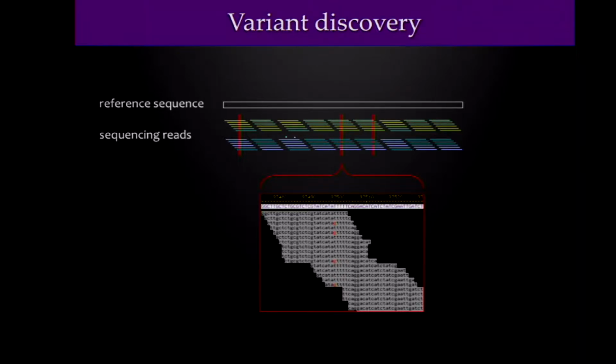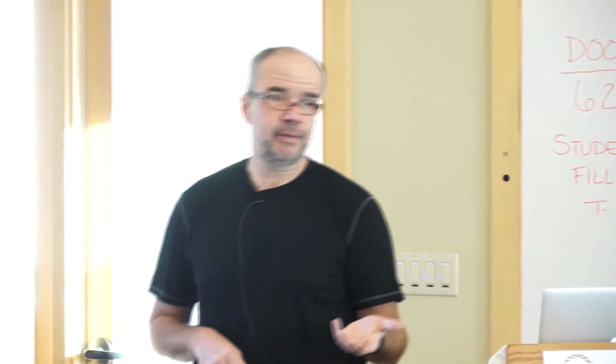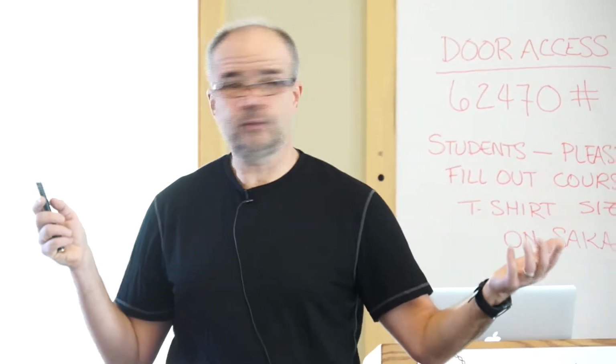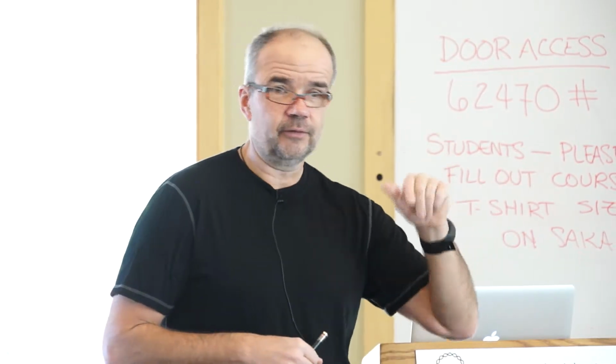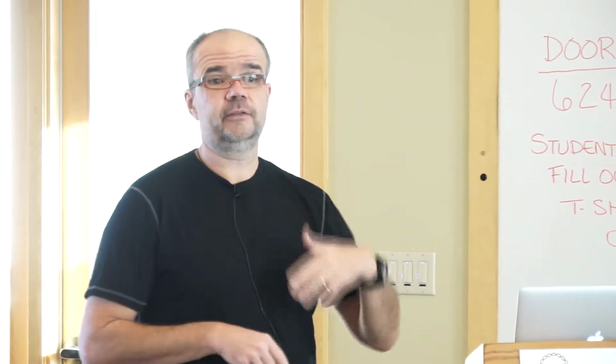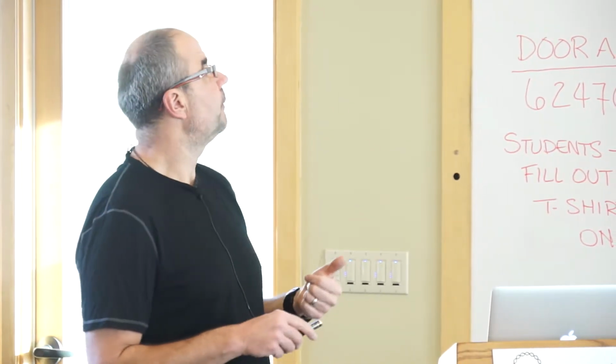So in technical terms, how do you go about what's called read mapping? First of all, why do we need read mapping? Because we can't read out entire chromosomes with current technologies. There's no technology that can say, okay, I want the sequence of your chromosome 7, and then base 1 on chromosome 7 gets read out, and you just linearly read it out until the last base. There are just no technologies like that. You have to read DNA sequences out in smaller chunks, and that was basically what this course is about. So that's why we need to place those sequences in the bigger picture relative to a particular human chromosome or the human genome.